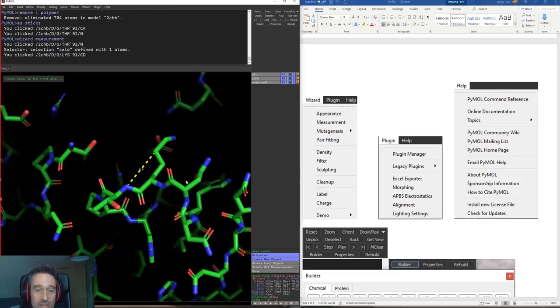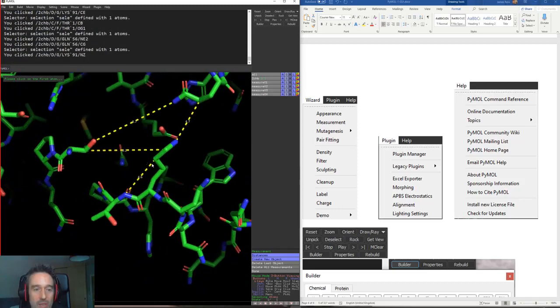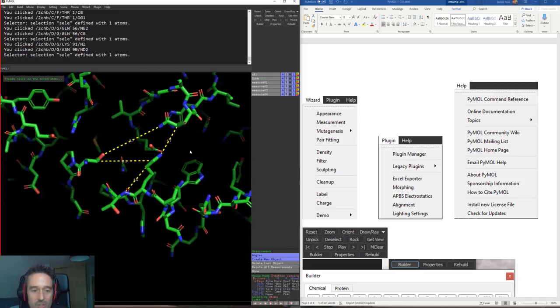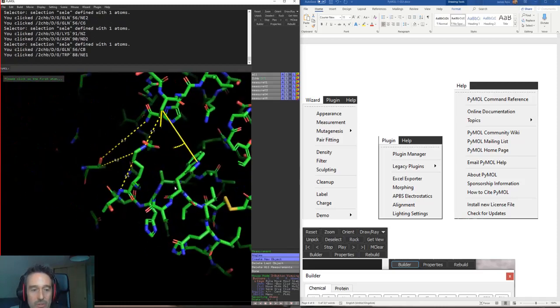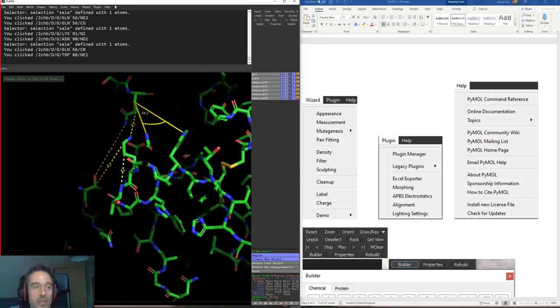get a measurement. Now, unlike the editing mode, these are permanent, and they're also added as options up here, little selections as such. And we can continue to just manually make measurements as we choose inside the environment here. And it's the same with the angles, except of course you're going to choose 3 different positions there, and we can show our angles there.